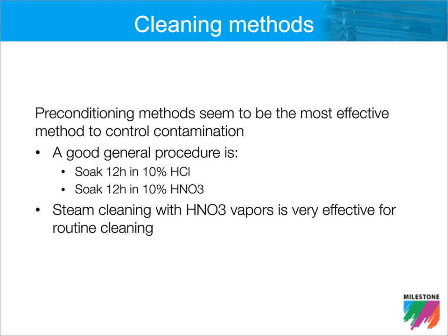One is that it is time consuming, both from the actual cleaning process, but also the rinsing, the washing, and the drying step subsequent to the cleaning. Cost can certainly be a factor. To be effective or to maximize this cleaning effectiveness, routine changing of the acid will be required. And finally, there is, of course, a safety component, as this will expose analysts to large quantities of acid.